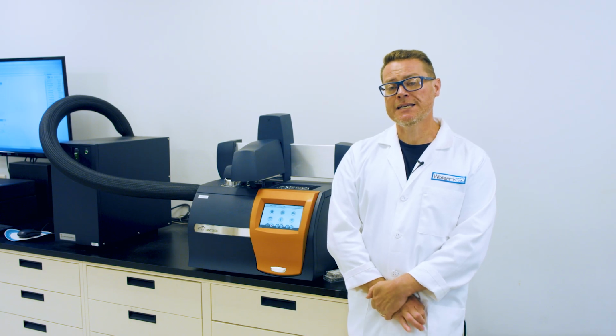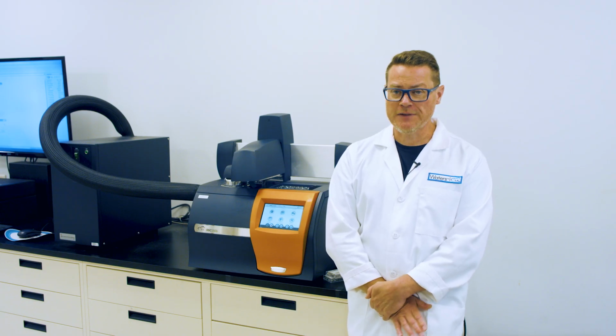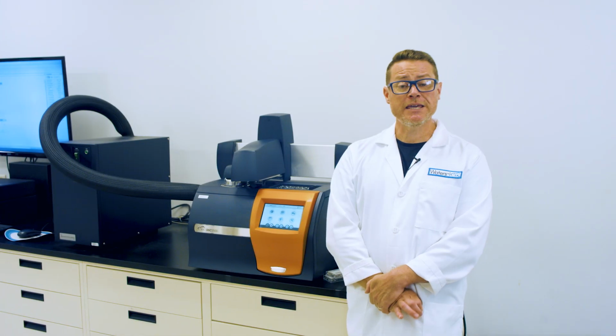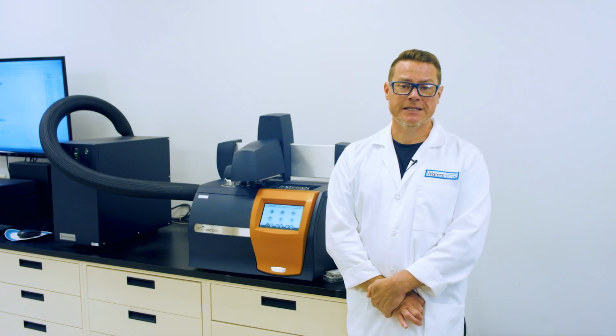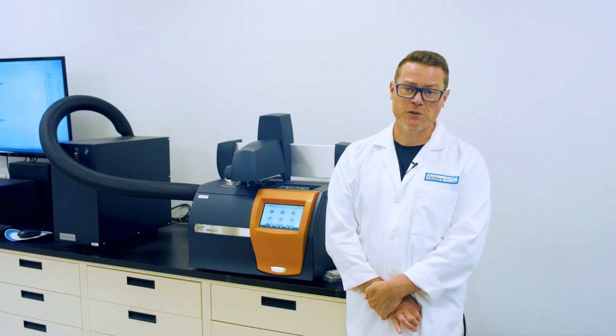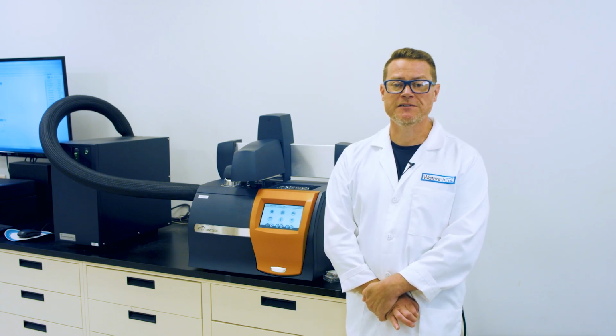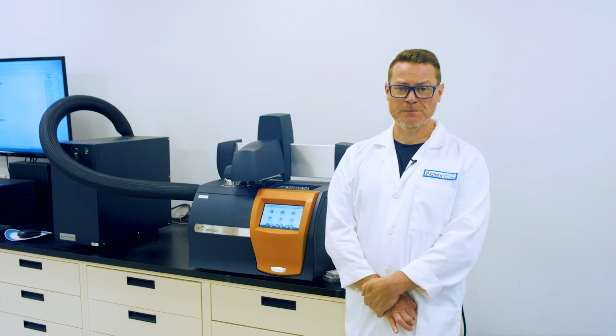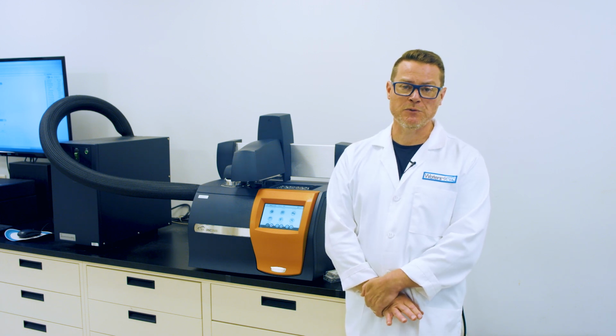Unless you're making detailed measurements on heat capacity, the reference material can be an empty pan. To make a measurement then, we tell the DSC to heat our sample and reference materials from an initial temperature to a final temperature at a specified rate. I'm only going to refer to heating from this point on, but remember, the same principles apply to cooling.